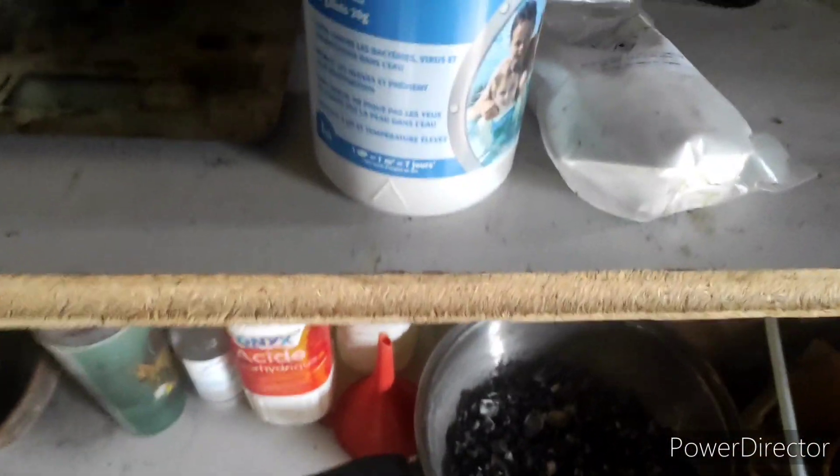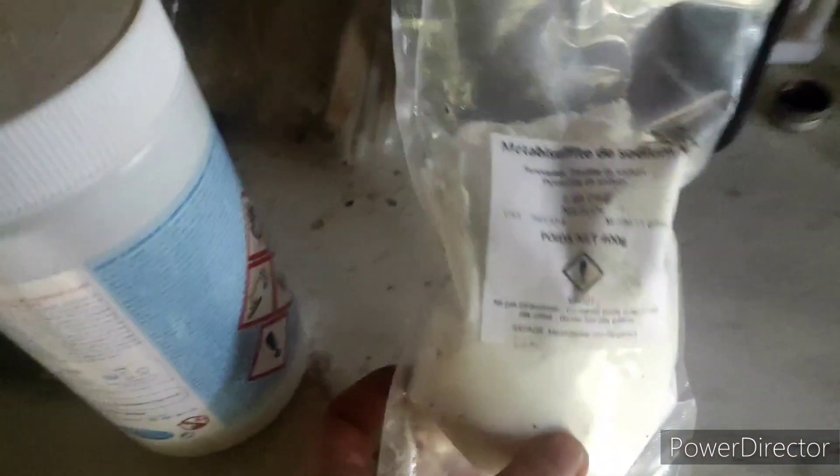Hello dudes, and welcome back to my lab. Today I wanted to make some bromine out of a pool chemical known as BCDMH. We will use sodium metabisulfite as well, and the reaction will occur in a distillation setup.